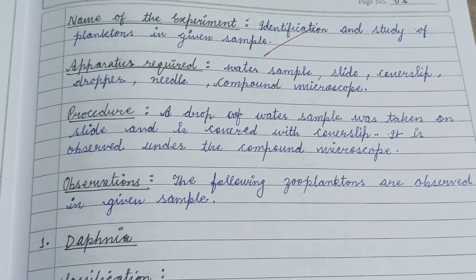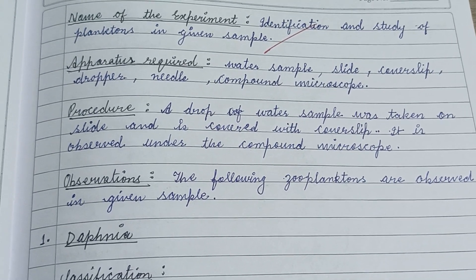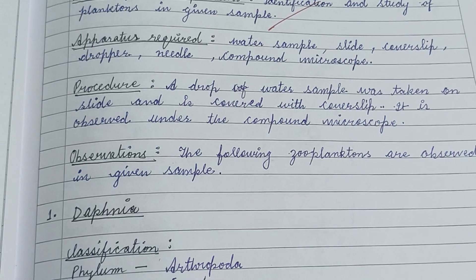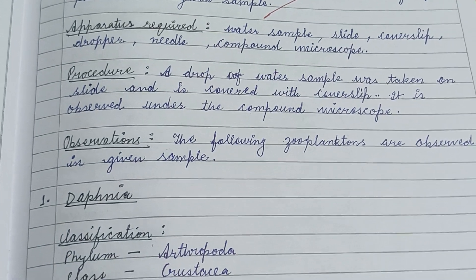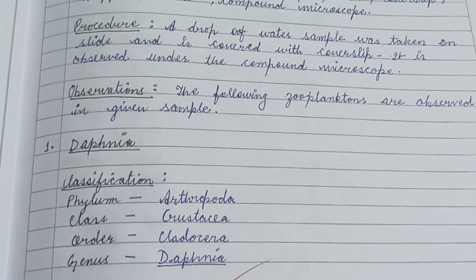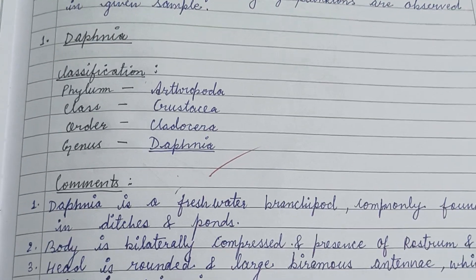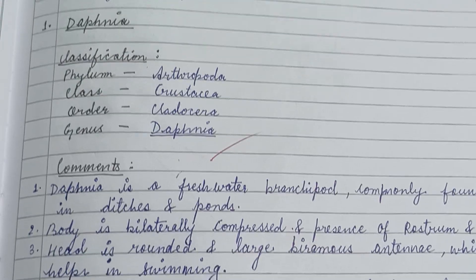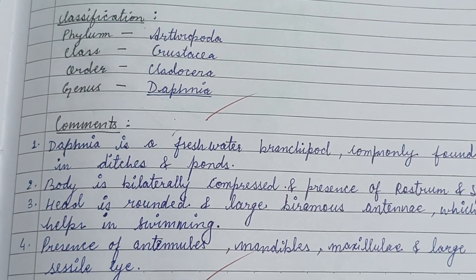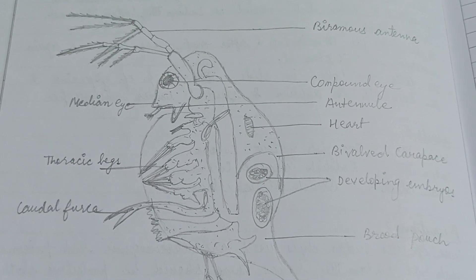Hello, this video is about the identification and study of planktons in a given sample. It is included in the histochemistry section of the practical geology semester 2. Here are some organisms found in the slide as shown in the microscope.